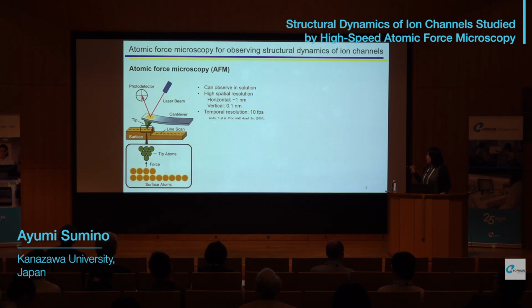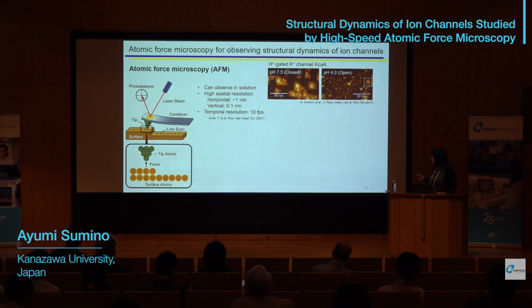And if we use a high-speed type of AFM, we can get 10 frames per second imaging in the best case for biological imaging. So I have used this technique for more than 10 years to see the structure of ion channels.